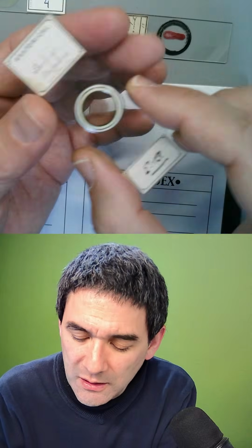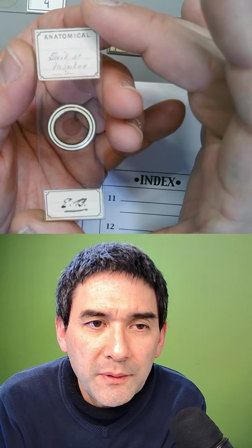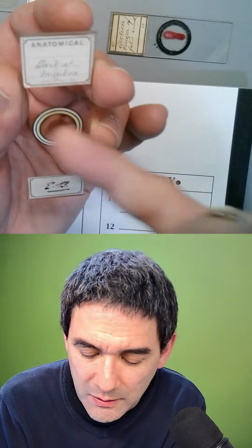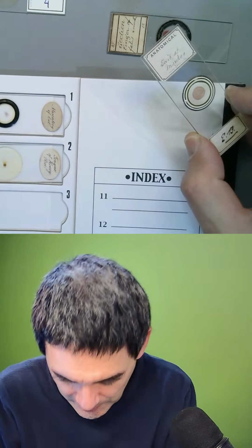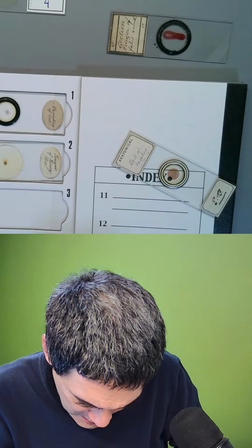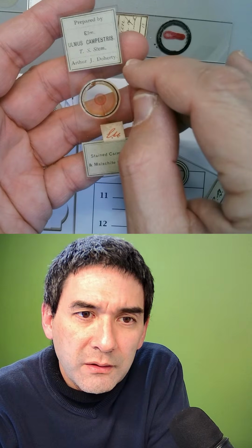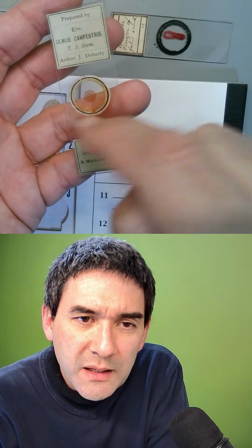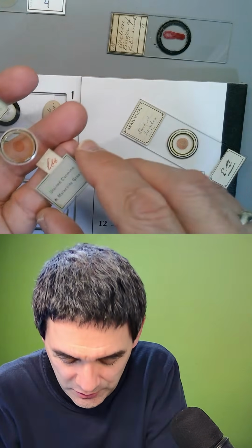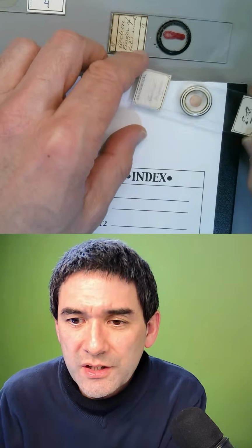Unfortunately, I do not know the year when it was made. But the ring pattern here is similar to the one of, maybe it's from them, Arthur J. Doherty, right? He's always making those ringed patterns in here. So maybe it's from the same one. I don't know. So the monkey tail, that's an interesting one here.